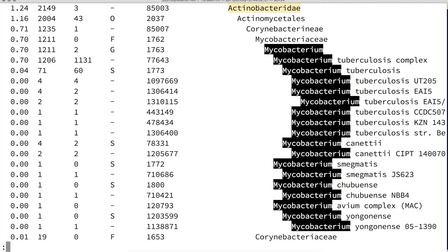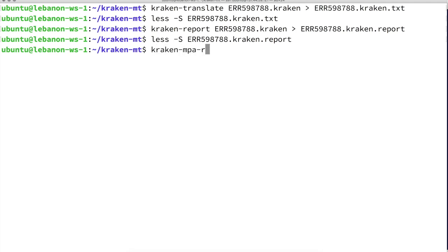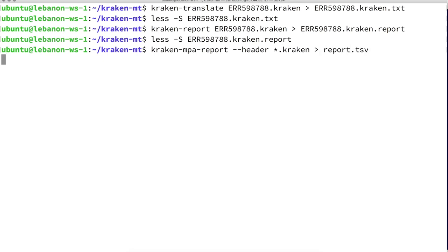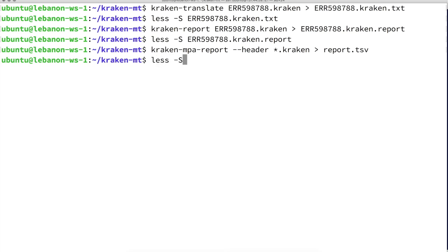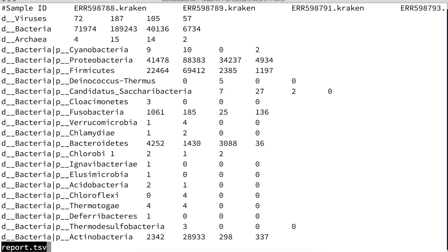What is useful sometimes is to compare different samples. Let's use the final tool: kraken-mpa-report. We include a header line and provide all the Kraken output files, creating a report.tsv — a tab-separated values file — that represents the abundance of each taxon in each sample. So it's basically a matrix. Our first problem is that when we look at a table from the shell, the columns are not nicely aligned because of longer taxon names. We can deal with specific tools to overcome that problem.